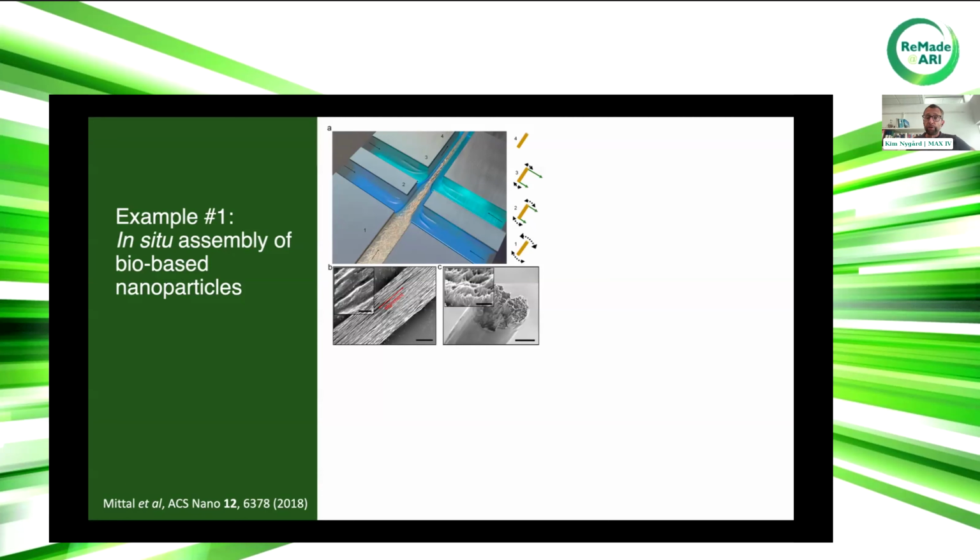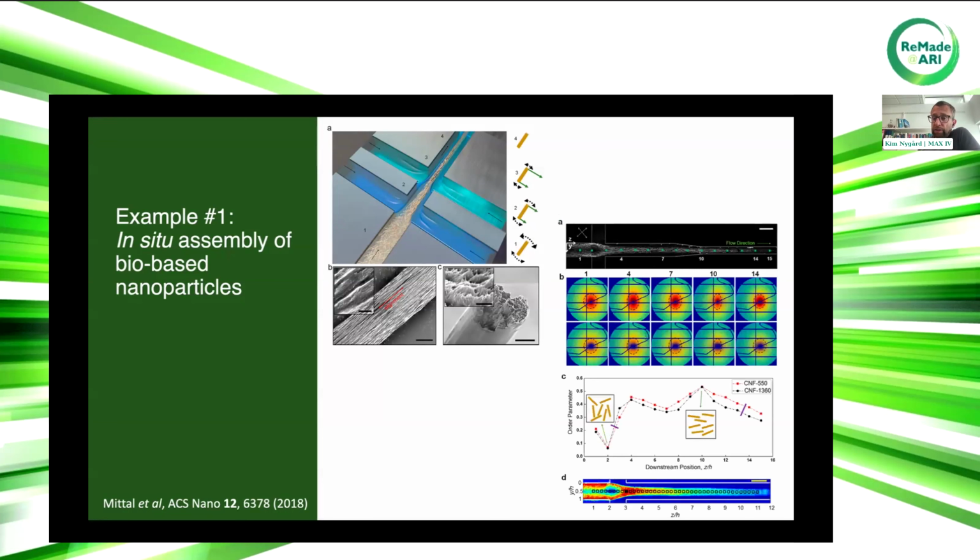They have these microfluidic chips where they flow the suspension and focus the particles, and by scanning SWAXS, they can follow as a function of position in this chip how the orientation of the particles changes. That's shown here in the C panel, how one order parameter is changing, and they can estimate where they have a maximum orientation and where it would be.